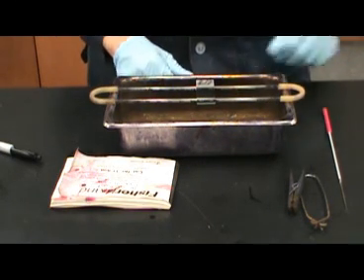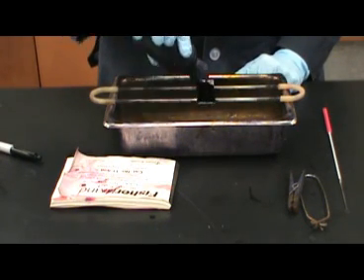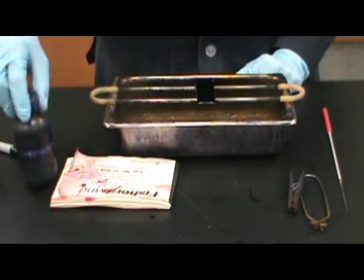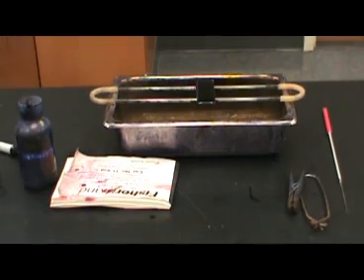For simple staining, we will be using methylene blue. Methylene blue, again, is a basic stain that has a positive charge. The positive charge of the stain will cause it to adhere to the bacterial cells, since the bacterial cells have a negative charge. Flood the slide with the stain and allow it to sit for 2 to 3 minutes.